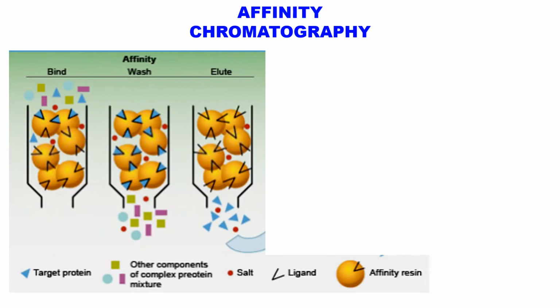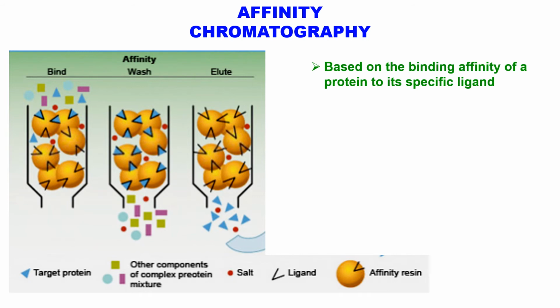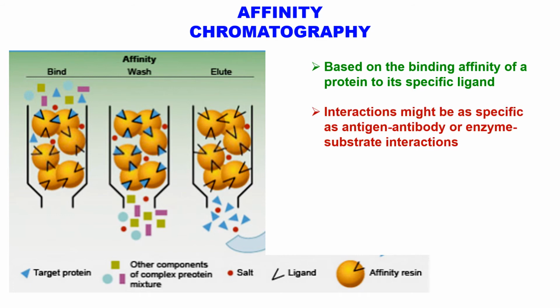So next is affinity chromatography. It is based on the binding capacity, or the affinity, of a particular molecule to the stationary phase. The interactions involved in affinity chromatography are as specific as antigen-antibody interactions or enzyme-substrate interactions.